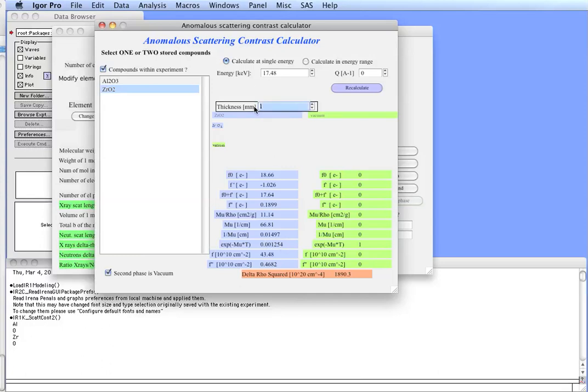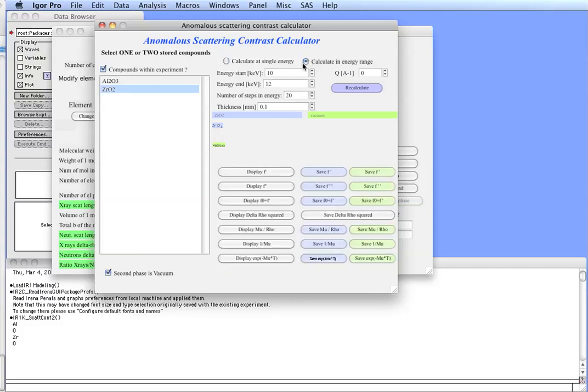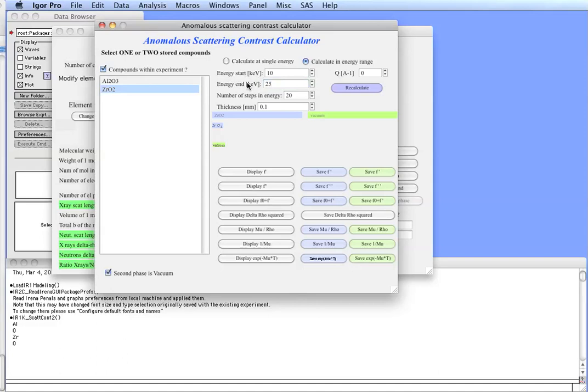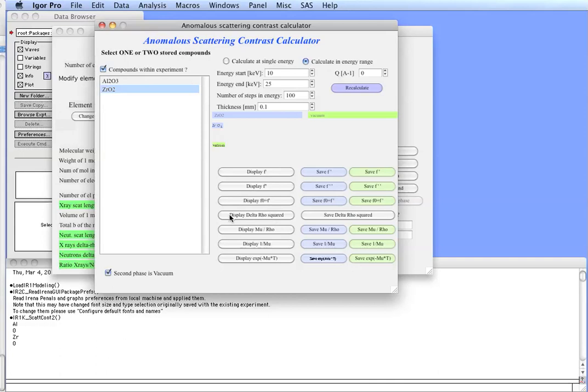Now, the other option we have is we may have a synchrotron or some other instrument where we can change energies, and we are looking for which energy we should pick the best for our specific sample. In this case, what we want to do is calculate the parameters in an energy range. So, we switch the tool in calculating energy range, and let's say we have an instrument that can go between 10 and 25 kV. Let's assume that we just want to roughly know where to go, so let's put 100 steps in here, and let's assume that we have still the 100 micron thick sample. Then, what we do is hit button recalculate, and after a few seconds, it comes back, and now we can display the results as a function of energy.